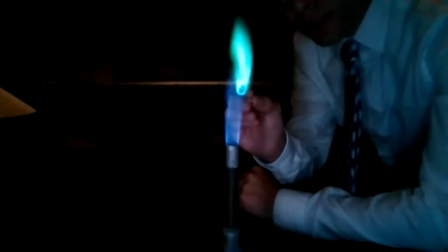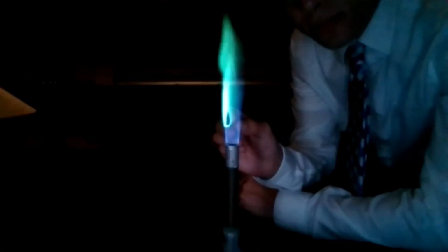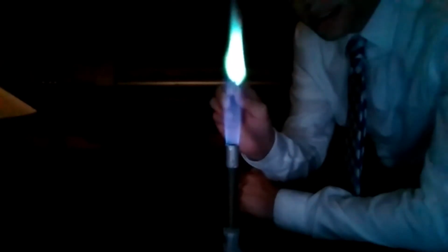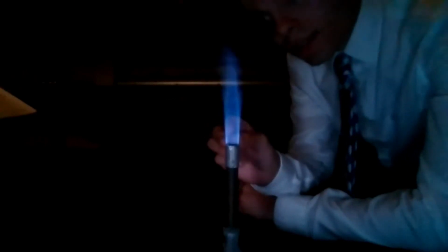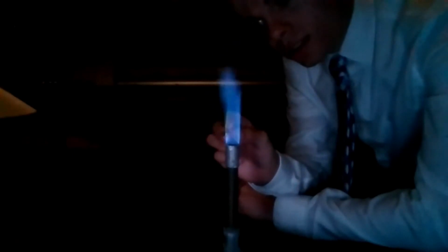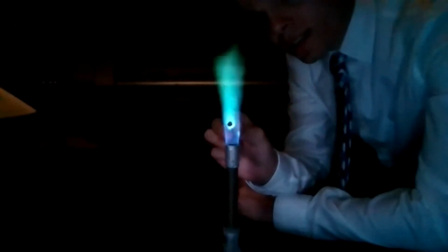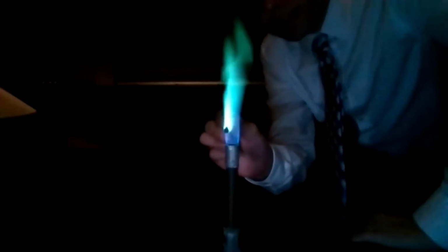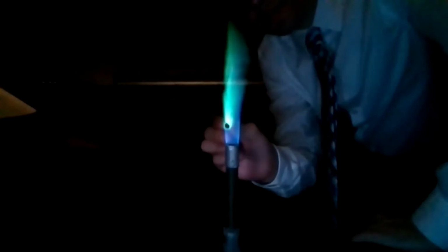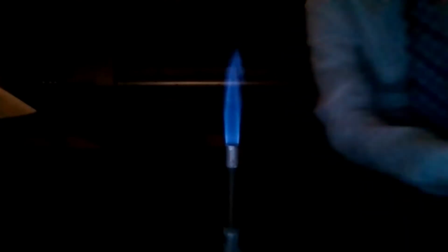Isn't that cool? Would you say that's like a teal color, or is it like a light blue? It's more of like a green. Okay. Yeah, it's definitely closer to that teal green color than it is blue. You can see it better if I hold it off. Oh no, I think, oh, there we go. Whenever you try to look at the color, it's easier to see if you look at the tip up there. I'm really glad I soaked these Q-tips so that they're not catching on fire.